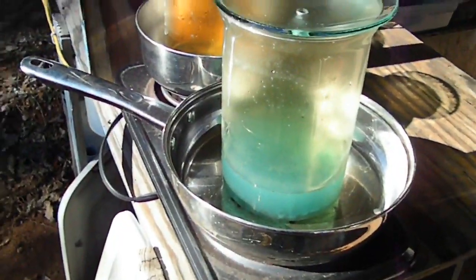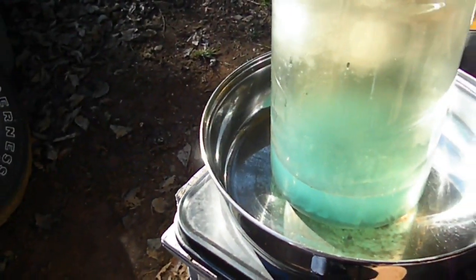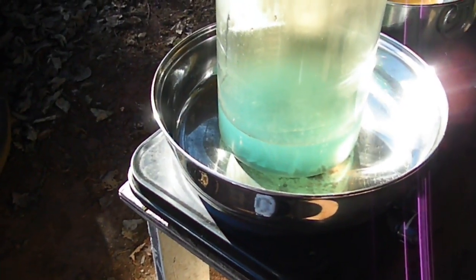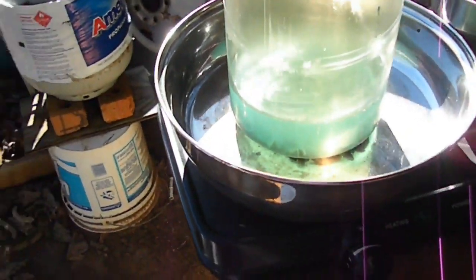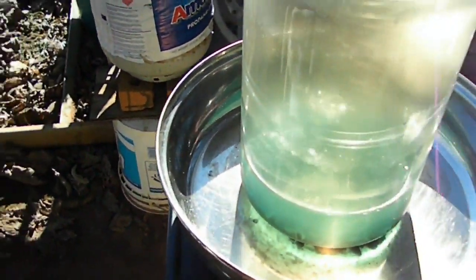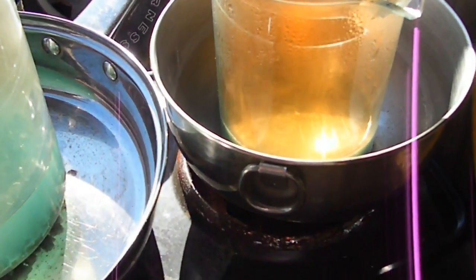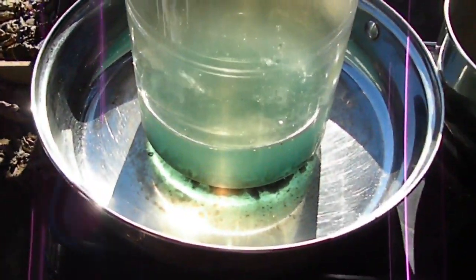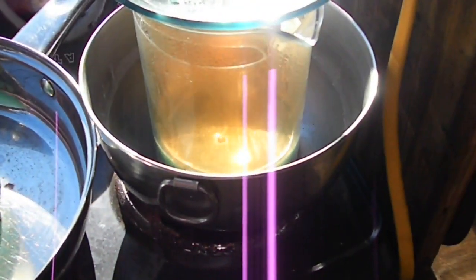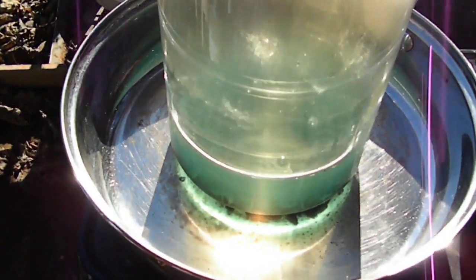Okay guys, I just wanted to pop in for a second. It's been about 30 minutes, and I actually did just put a tiny little bit of heat on, because even though we do have some bright sunshine, the beakers were still fairly cool. It actually kicked this one up quite a bit. This is probably twice the volume, so it's going to take a little bit longer, but got a nice good even reaction going. Nothing's going crazy.